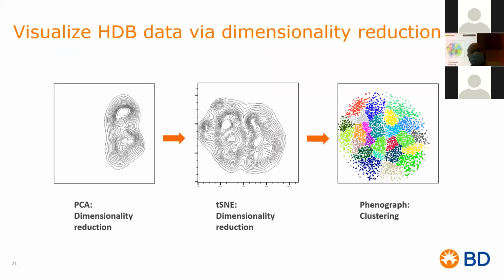Yes. So now that I concatenated the file, I want to generate my dimensionality reduction, right? Why? Because you cannot compare 2 different t-SNEs that are generated separately, because every t-SNE differs every time you generate it. So you cannot compare those. Non-deterministic, thank you. Or stochastic.